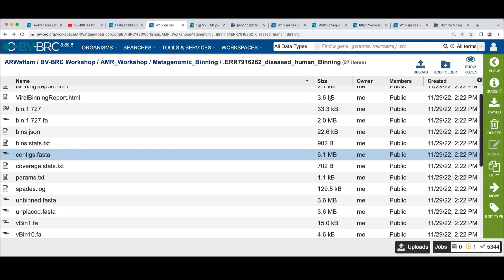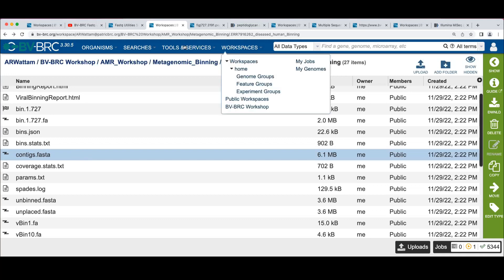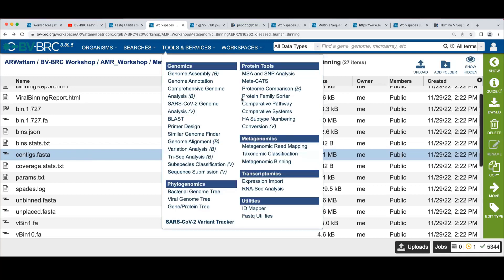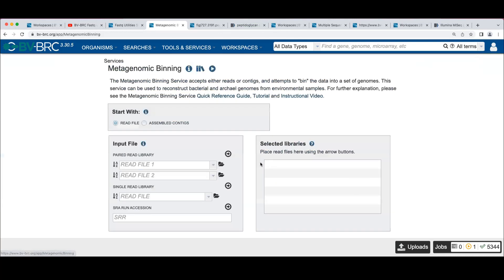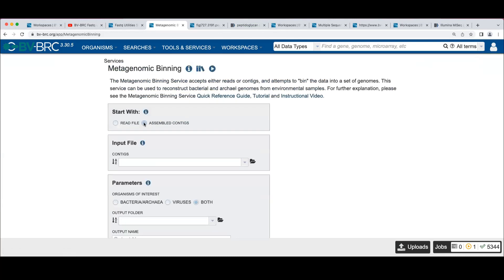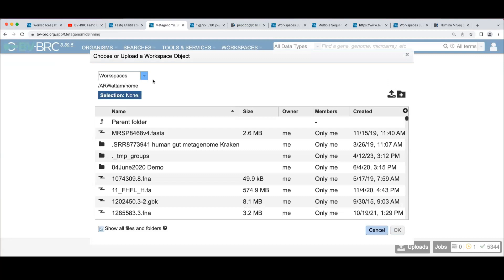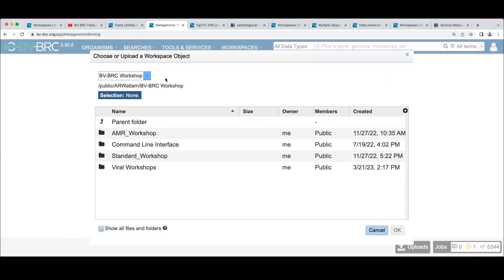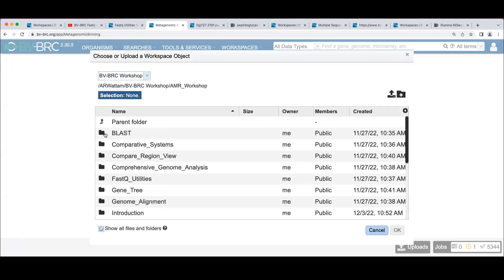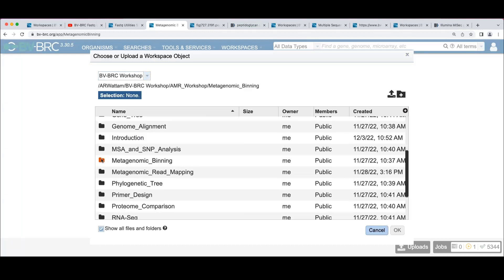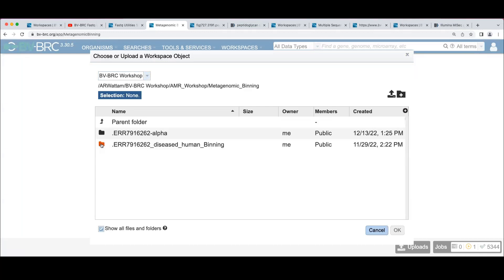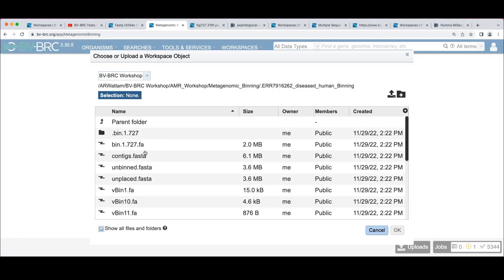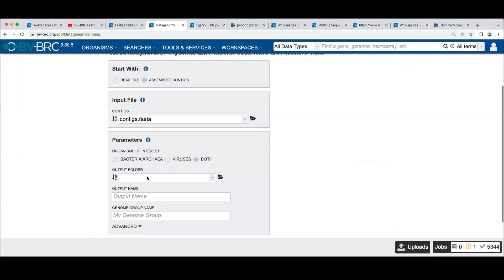Actually, I'll just, let's just do that. I'll show you what it looks like. We'll do the binning from the contigs. So I'm going to go back to binning. I'm going to click here to assembled contigs. I'm going to browse into the workshop, binning. There's my contigs file.